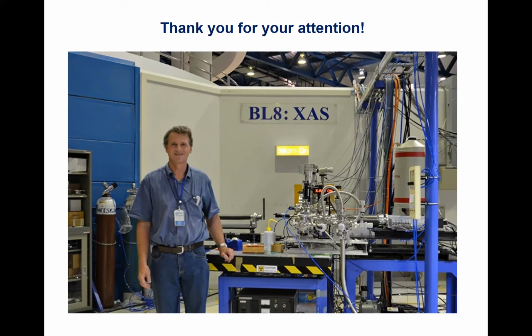I think there was a question maybe or comment from Kiyotaka as well. Okay. Yes. Thank you very much, Joe. My question is about the calcium K-edge XANES, and you show the pre-edge peak for all calcium K-edge. That is related to some symmetry or structure. I think so. Mm-hmm. Normally, the pre-edge peak always represents some symmetry or transition issues.